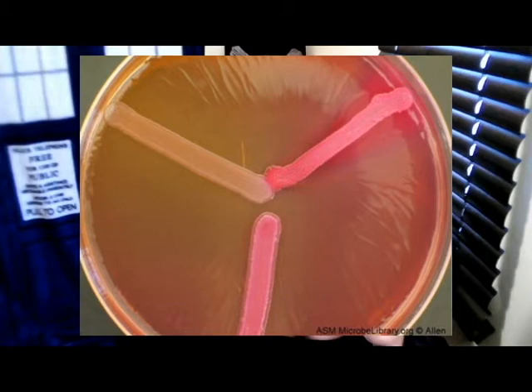If a bacteria is very much able to ferment the lactose, it will not only produce a pinkish color, but the salt that it absorbs will be put out to form a halo around the bacterial colony.